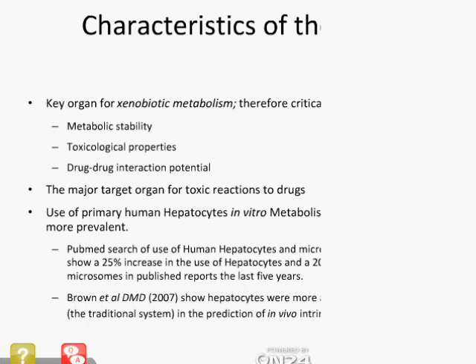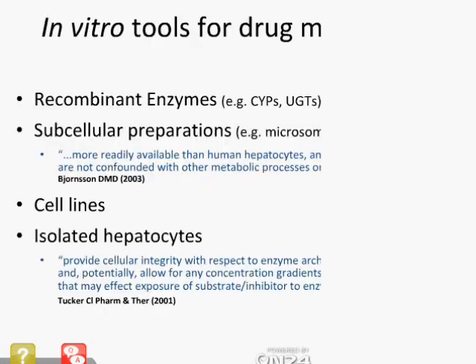I present here a simple list of various applications that employ hepatocytes or microsomes. In many cases, either system may be utilized. Choosing one over another will depend on your specific needs. In the case of inhibition, microsomes are the gold standard due to the simplicity and direct exposure of the drug and probe substrate. However, if transporters are involved in the uptake of the drug into the cell, hepatocytes may provide a better representation of the drug's inhibition potential as observed in the clinic.